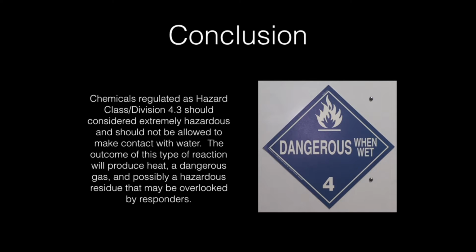In conclusion, in this video we have demonstrated that chemicals regulated as Hazard Class Division 4.3 should be considered extremely hazardous and should not be allowed to contact water. The outcome of this type of reaction will produce heat, a dangerous gas, and possibly dangerous residues that may be overlooked by responders.